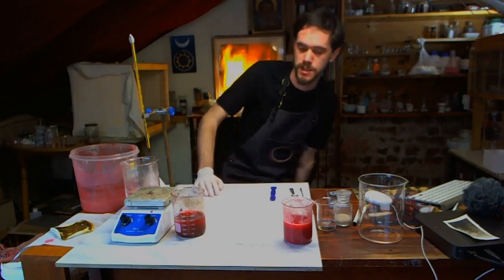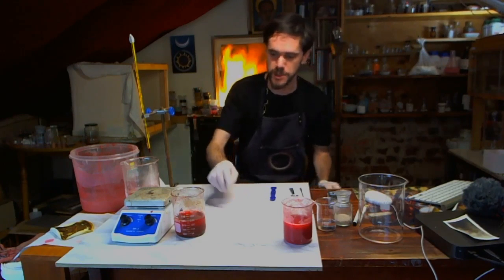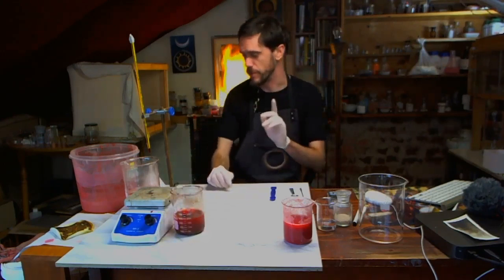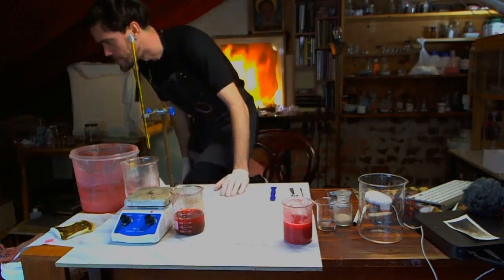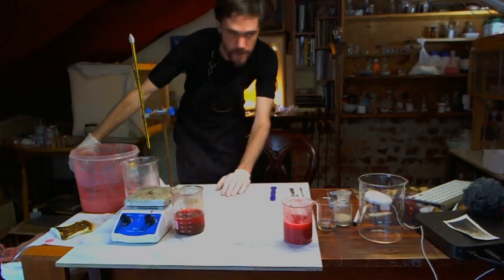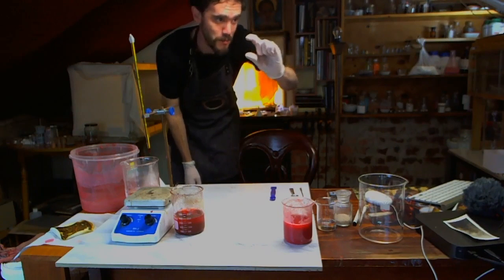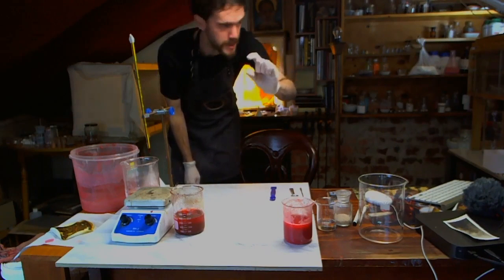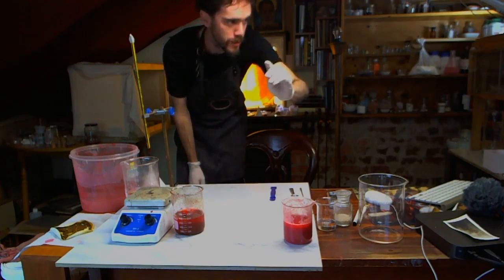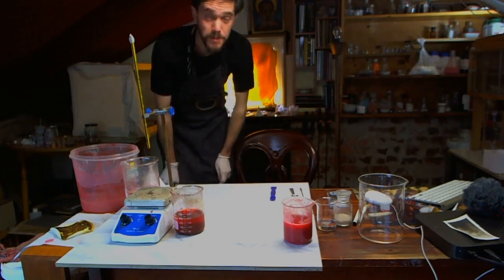Okay, now let's go through the next bit here. By the way, what's going on in the filter funnel is it's dropped by about that much. So what's that been, about 20, 25 minutes since we put the thing on? So it's getting there. It'll take time.